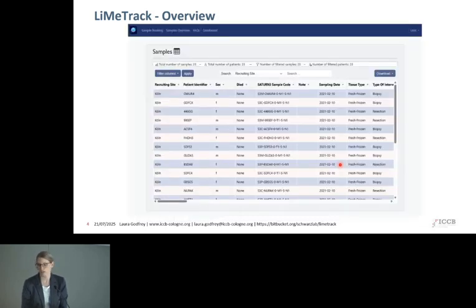Our sample tracking tab serves then as the complete overview table, where you have all the data displayed in a tabular form. We have a variety of options to filter rows and columns, and a patient and sample counter in the header summarizes the currently applied filters in comparison to the overall samples that are currently recruited in the project. You could download a filtered or the overview of all samples here that could be immediately fed into pipelines, for example, in Snakemake or Nextflow, to analyze your data.